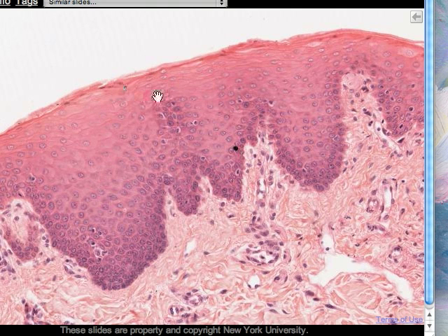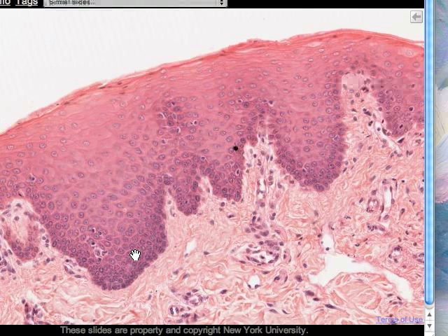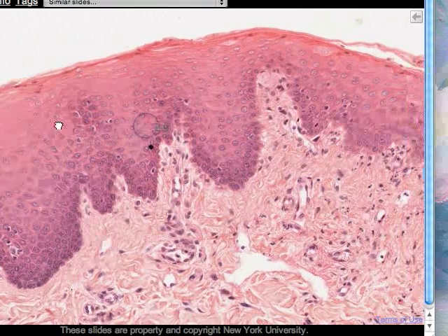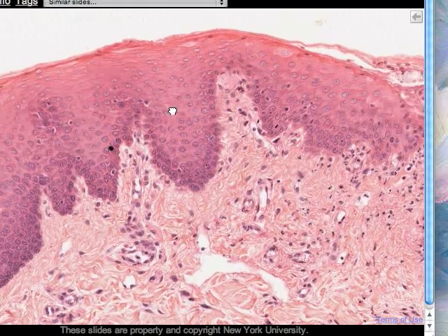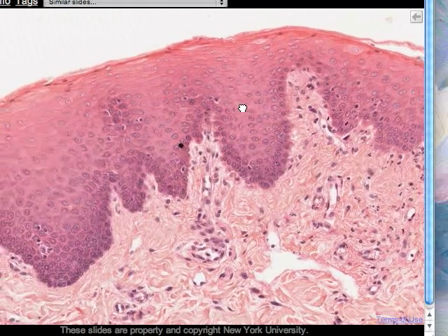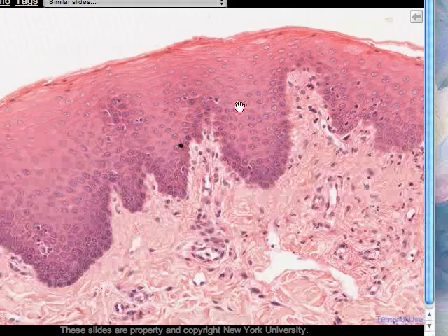You might want to compare the number of cell layers and general disposition of cells in stratified squamous non-keratinised epithelium with those in stratified squamous keratinised epithelium. You will also note that there are no hair follicles here, because of course there are no hairs on the inner surface of your lip.